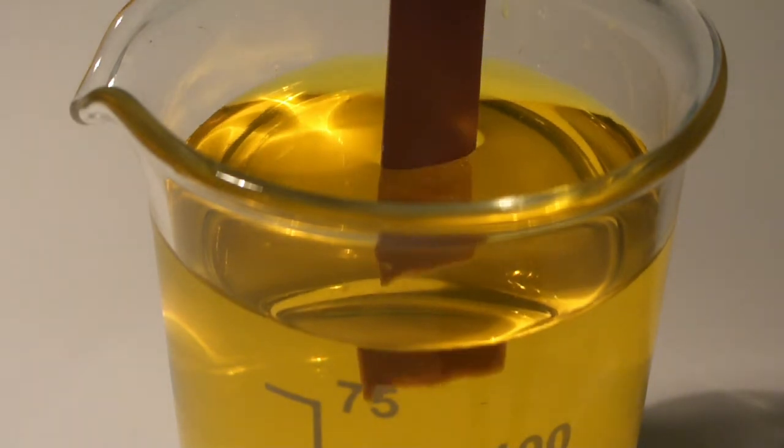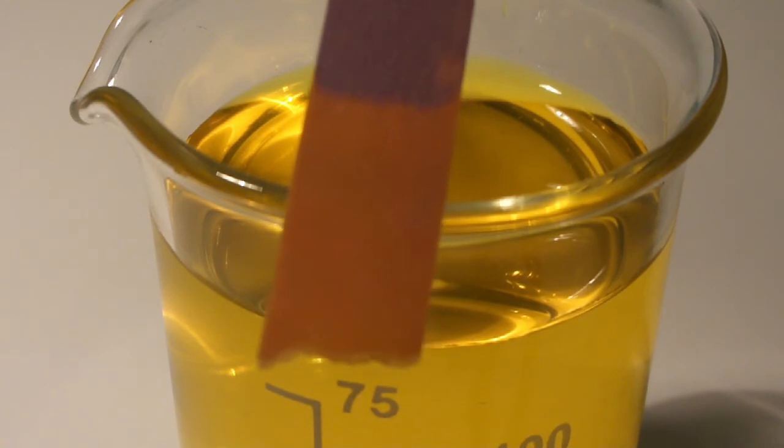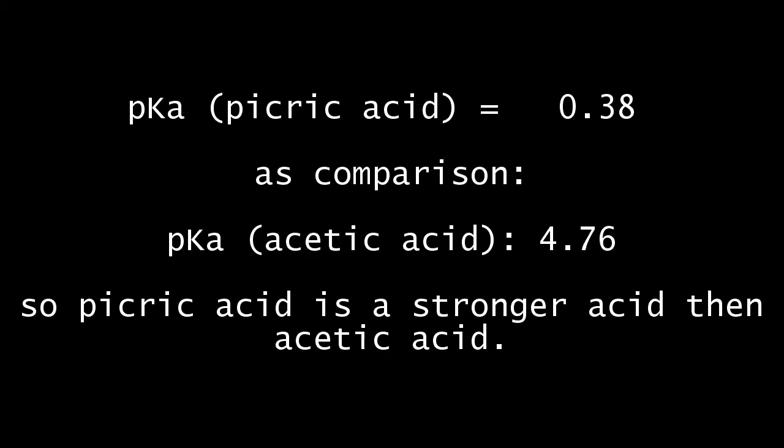So let's first check the pH of the solution. It is strongly acidic. By the way, the name of picric acid comes from the Greek word pikros, which means utterly bitter.